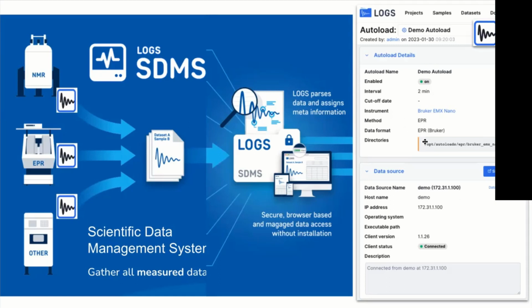And right here is also already the first instance that you can see that metadata is already entered with the data, with the measurement data in the system, right? Right here, you already can see, it's an EPR spectrum, maybe even the data format. And here we have a directory that's being searched, and more often than not, scientists, of course, have more information in the directories, the name of the person, maybe, or the name of the project, or the name of the sample.